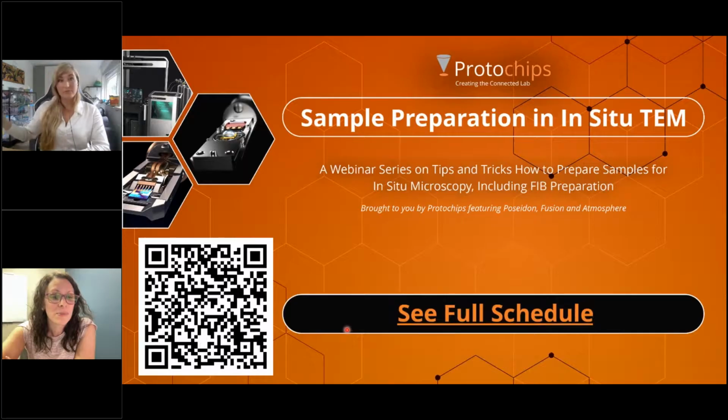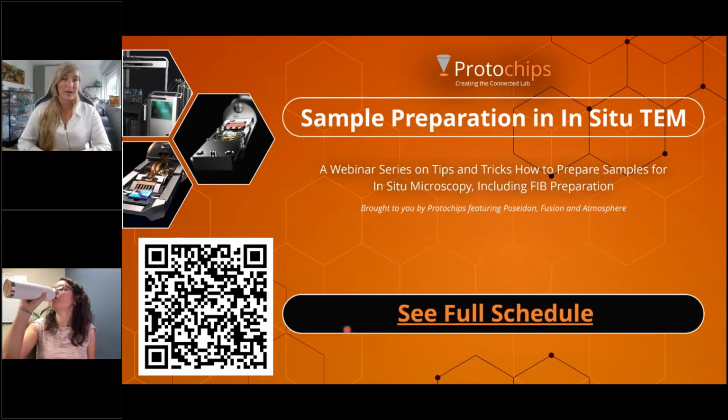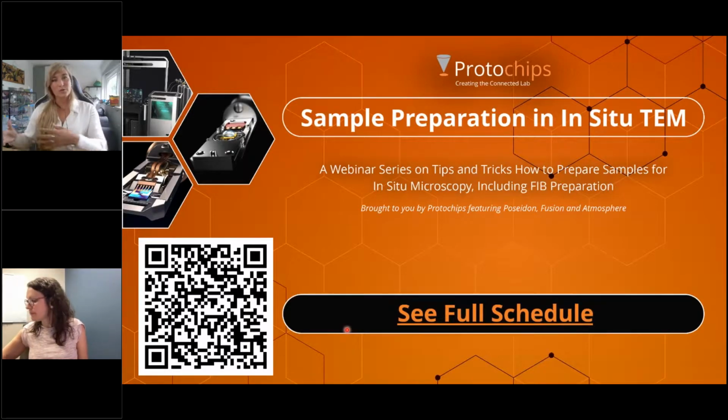About the small steps when doing a CV, is it only related to the danger of generating bubbles, or is it also related to the capacity of the holder's electrical instrumentation to withstand harsh variations in potential? It's a good question, but the holder can withstand quite a bit of variation. We've even seen people go all the way up to 4 volts with our electrochemical in situ setup, so you can go to very wide variations. It's mostly the gas formation, and also to have a bit more control over what your reaction is doing.